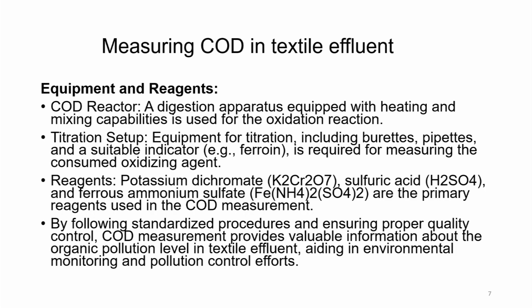used in COD measurements. By following standardized procedures and ensuring proper quality control, COD measurements provide valuable information about the organic pollution level in the textile effluent, aiding in environmental monitoring and pollution control efforts.